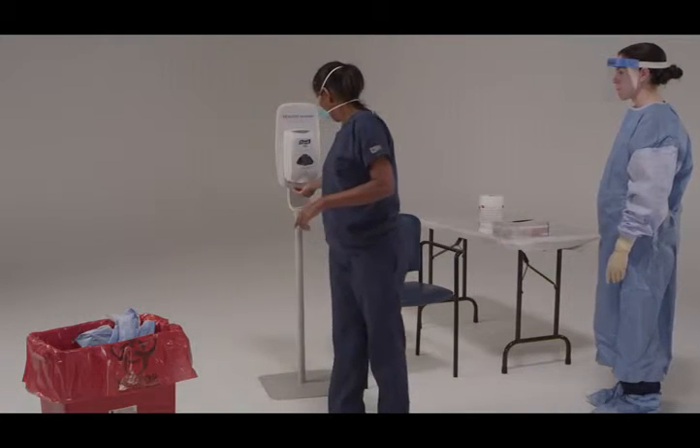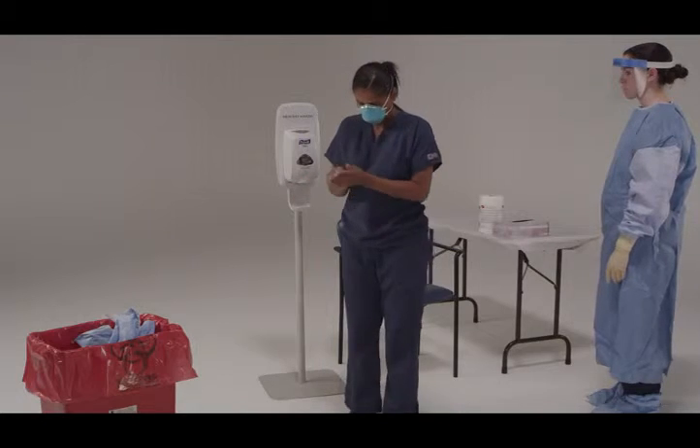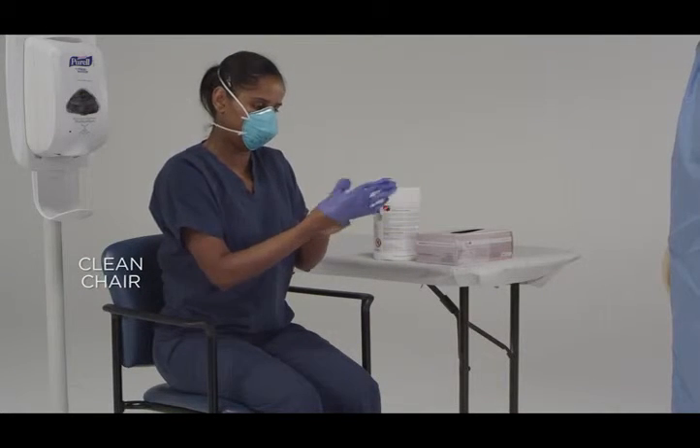Perform hand hygiene using alcohol-based hand rub only. Then put on a fresh pair of gloves and you're ready for the next step.